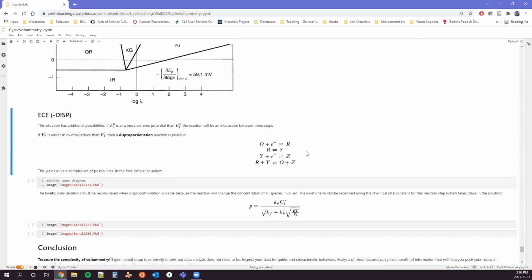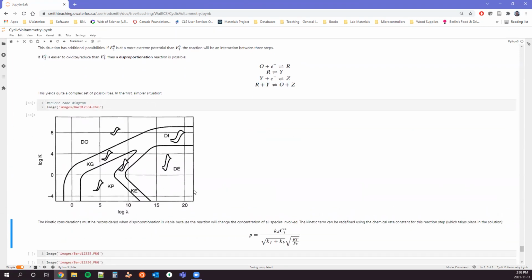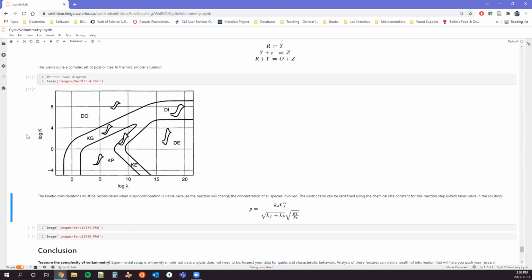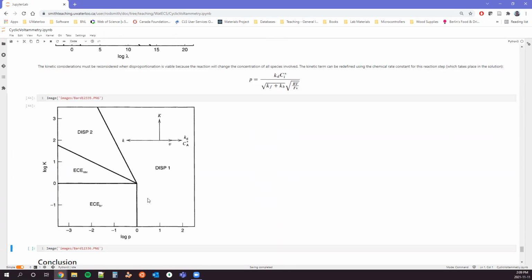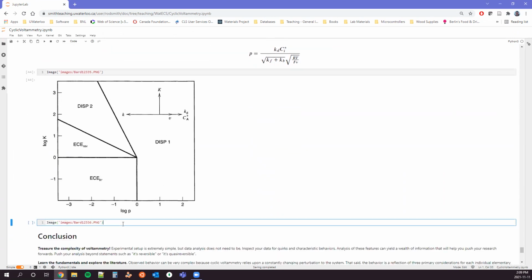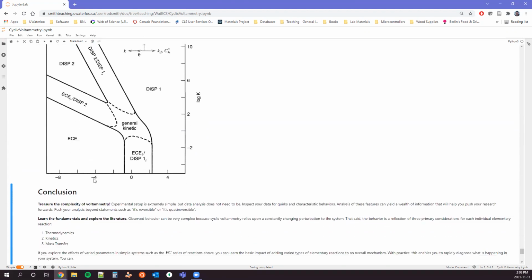In ECE, electron transfer, chemical reaction, electron transfer, there's a possibility here, if the second transfer is easier to do thermodynamically than the first transfer, that we have a disproportionation reaction that we have to factor in. And so this is going to factor into all of this as well, right? We can generate, again, these characteristic behaviors that we expect to see based on the thermodynamics of the chemical reaction and our dimensionless parameter. If we get into the situation where that disproportionation reaction factors in, now we have a very complex series of possibilities, all fundamentally different reaction mechanisms. If we show it in its full complexity, we can see that we have pure situations, our limiting situations, and in between all of them, we have this kind of blended behavior, right, where we see contributions from both.